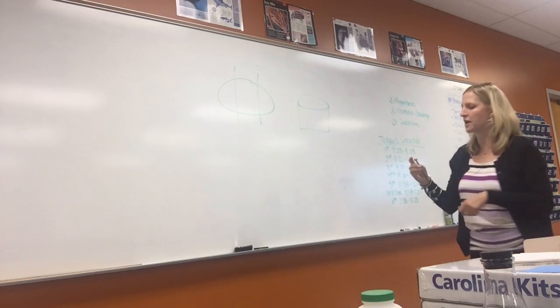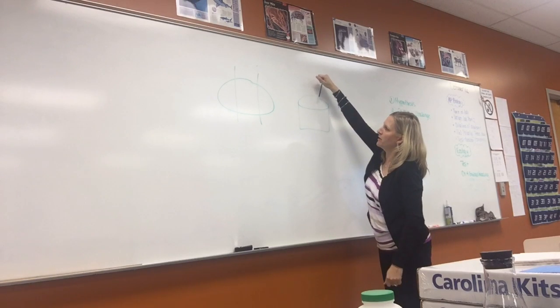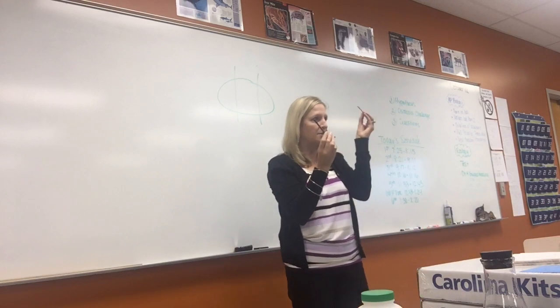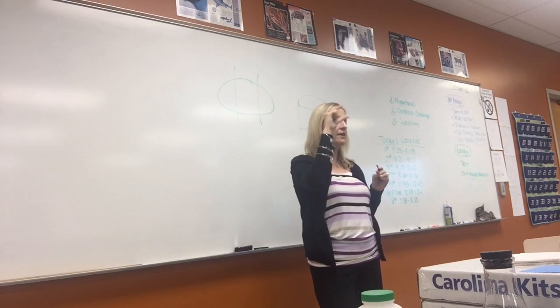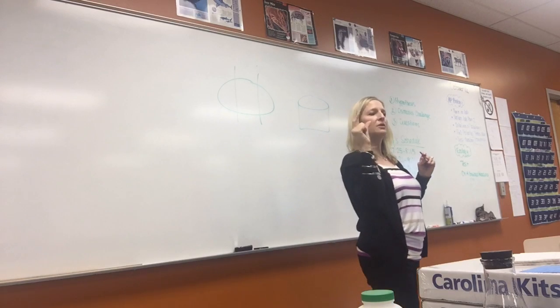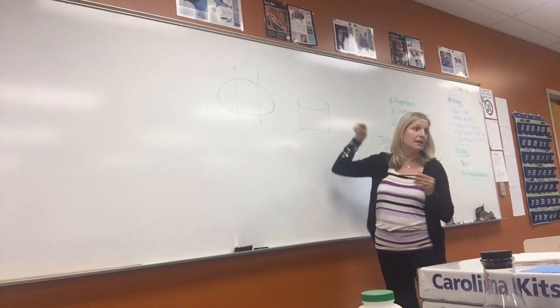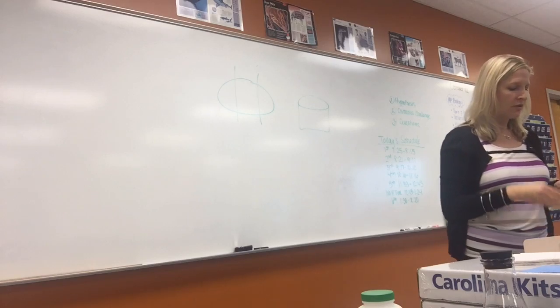Then what we can do is put your potato on the desk and take the cork borer and push it into the potato till it hits the desk and take it out. And what you'll have is a cylinder of potato in there. To get that out, that's what this little guy is for. You can push it in and it'll push out this little cylinder of potato. This will be so that you have uniform pieces and sizes of potato, so that will not be a variable in your experiment. You'll have these little cylinders of potato, and they won't have the skin on it. Therefore, the cells inside are exposed to the environment. So that's what a cork borer is.